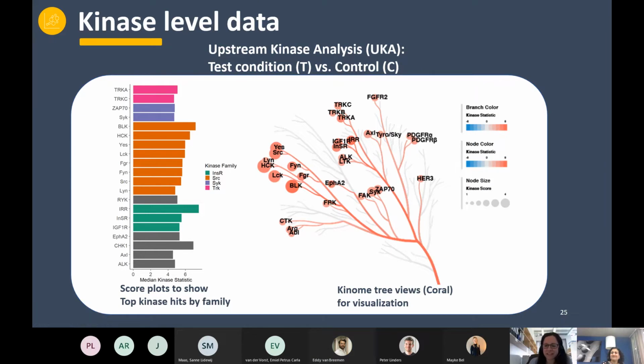I'm really excited about this coral tree. I'm just preparing the trees with the KinMap tool, which is the tool where you could highlight the different kinase classes. From your previous slide, maybe I missed it, how can this be done, online based or in the BioNavigator?